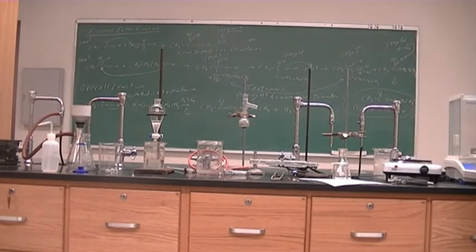All right, 2 grams of magnesium sulfate. So this is just to get rid of the water. You don't need to write down the actual mass, so about 2 grams. All right, 2 grams. And we're going to put that in the beaker.